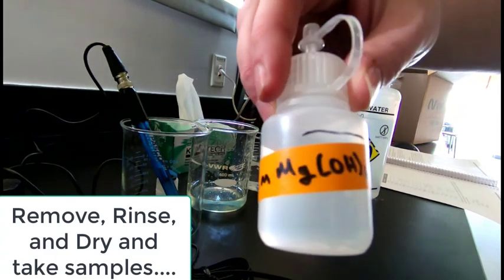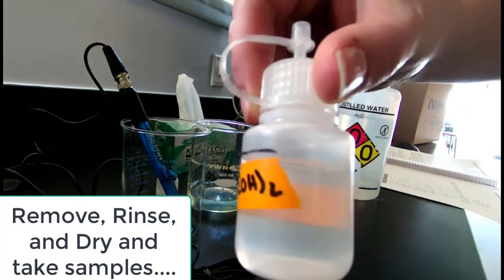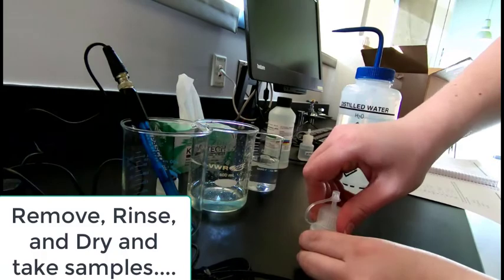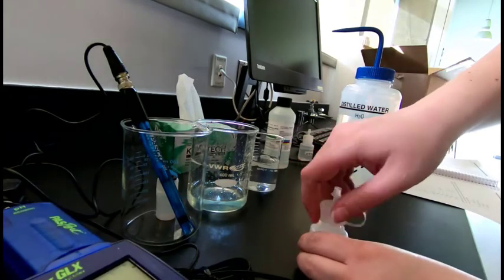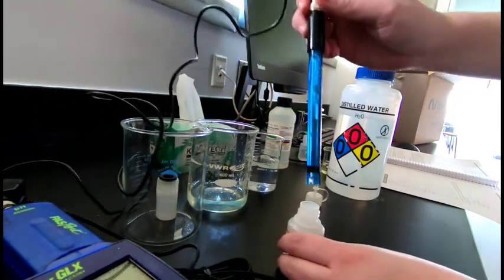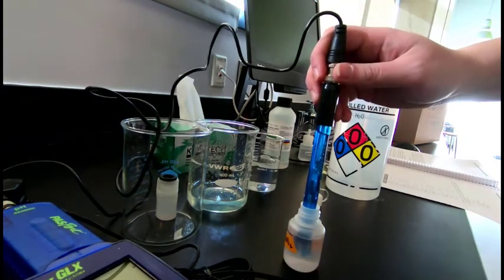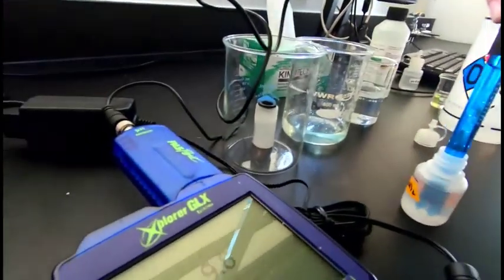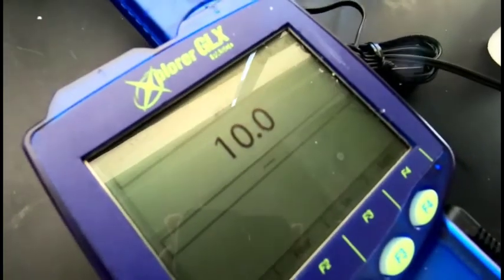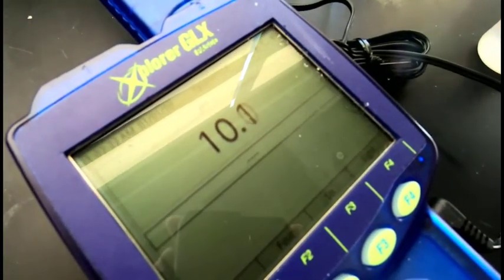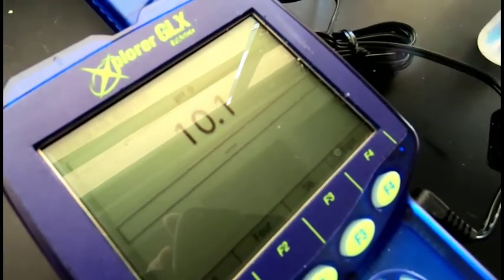And so now we're going to just do a measurement. It's been calibrated. And we're going to actually do a measurement of the 0.03 magnesium hydroxide. And this is an example.